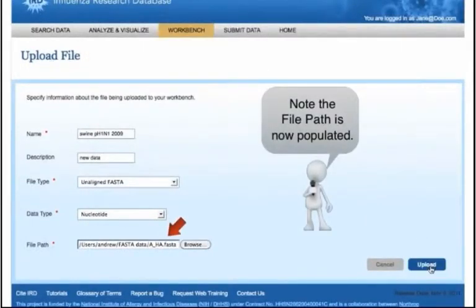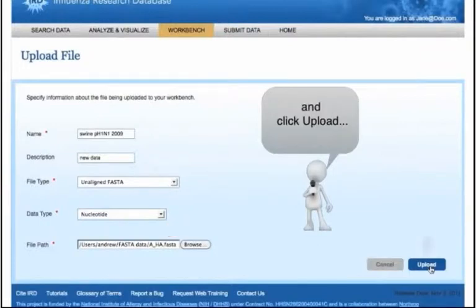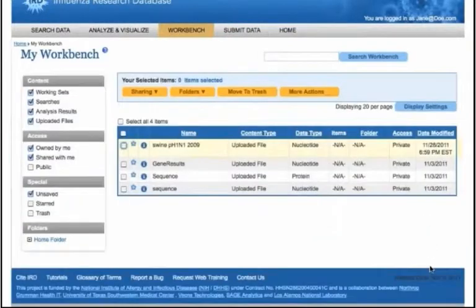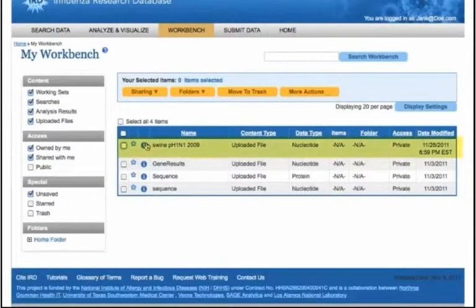Finally, click the Upload button on the browser to complete the process. The uploaded file is now listed in the Workbench table.